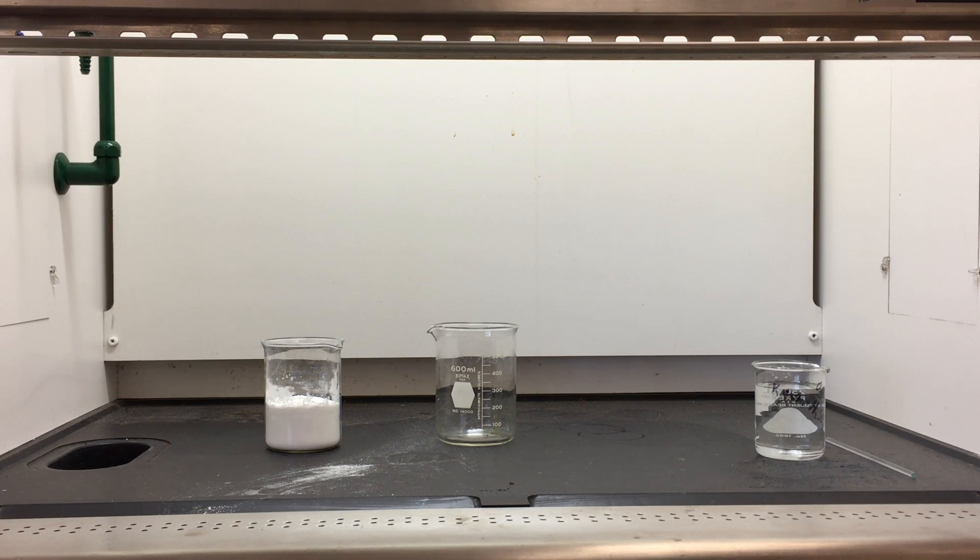Hello from Chemfax Labs. This is Dr. Nick Jordan and Dr. Dylan Zuck on the Carbon Graphite Foam Dehydration of Sucrose Lab.